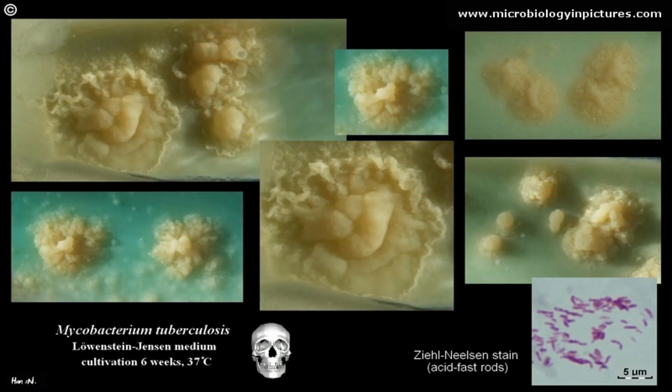Okay. So next we have Mycobacterium tuberculosis. The media for this is quite different. Here we have Lowenstein Jensen medium, this greenish, bluish color media, and on this media, look at the appearance of the colony. Okay, it's quite different, and it doesn't react well with gram stain.